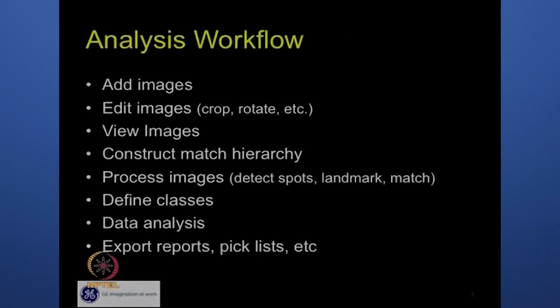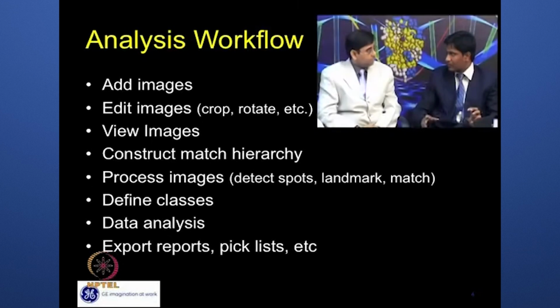Then visualization of images. Then construct match hierarchically. There is a procedure for how to create a match set and how to create a class set. There are two differences. This we will discuss more in our software demonstration.